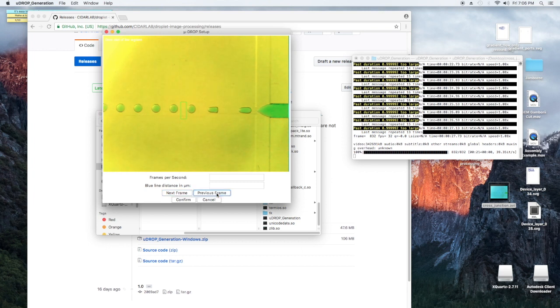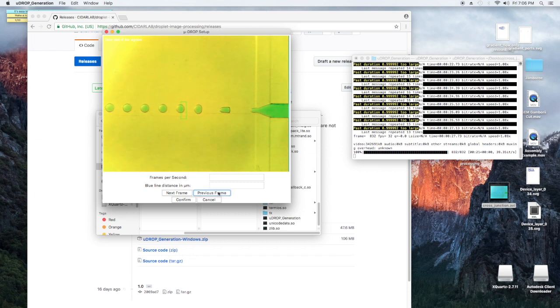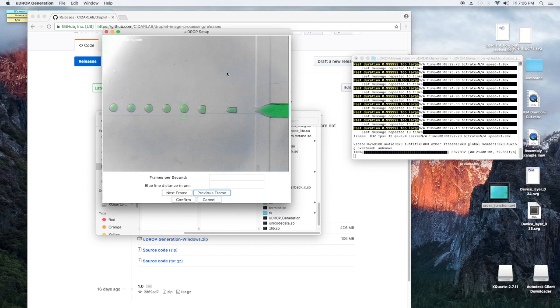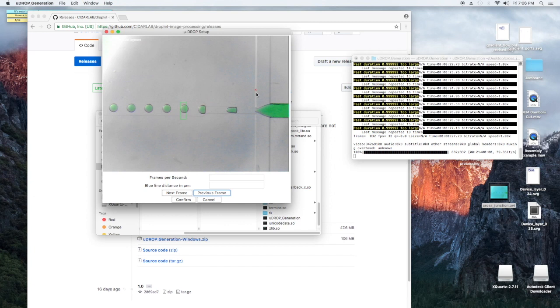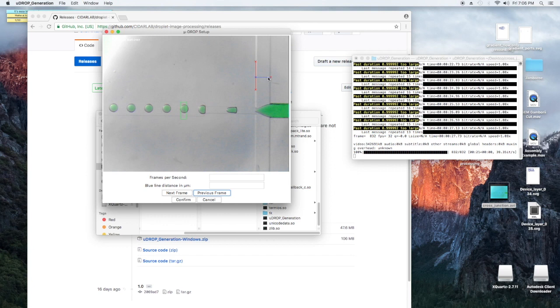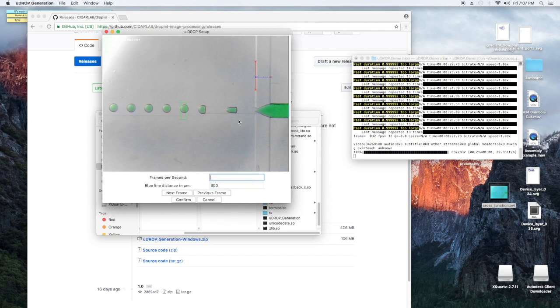Next we're going to have to specify to the program the micrometer to pixel conversion. So the way that you're going to do that is we're going to specify the scale of this video. We're going to give a real-world scale, so that's in micrometers, to the pixel scale, which you see on the video. So a good way to do this is I know the width of this channel. This is a 300 micrometer channel. So I can draw that width in pixels. So I'm going to draw my first mark here, my second mark here that forms a line like this. And then I'm going to draw a point off of here, and it draws a perpendicular line to this point. So this blue line distance is the pixel distance. It's probably like 125 pixels. And we're going to give that pixel distance in micrometers. So that's a 300 micrometer channel right here. And that's going to tell us how to convert from pixels to micrometers, so that these results actually mean something to you.